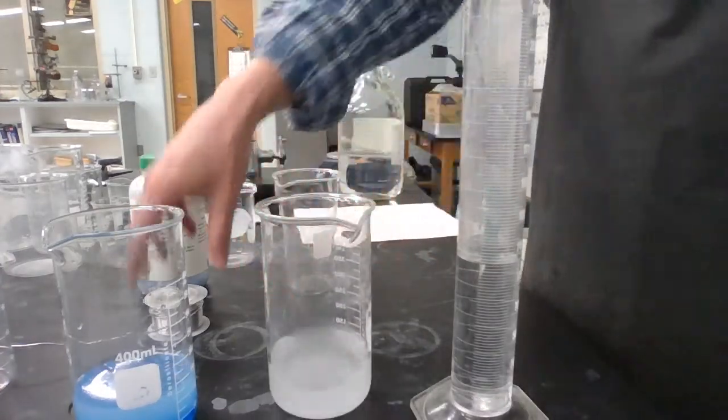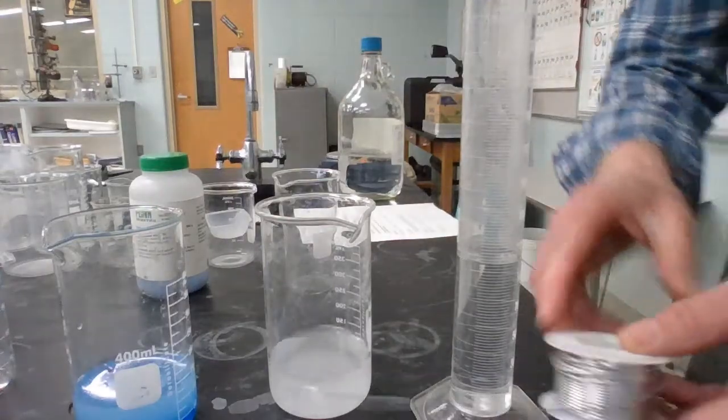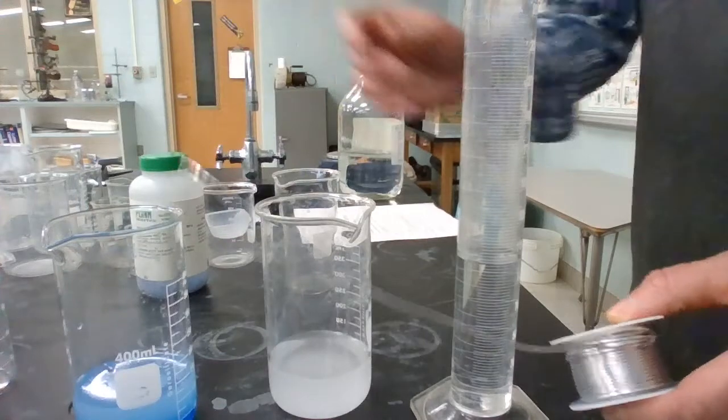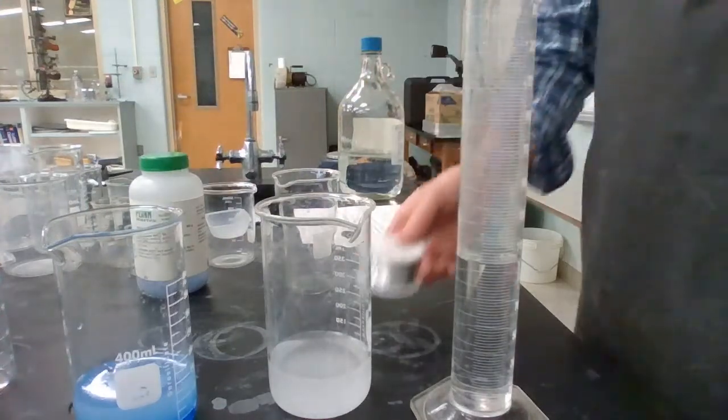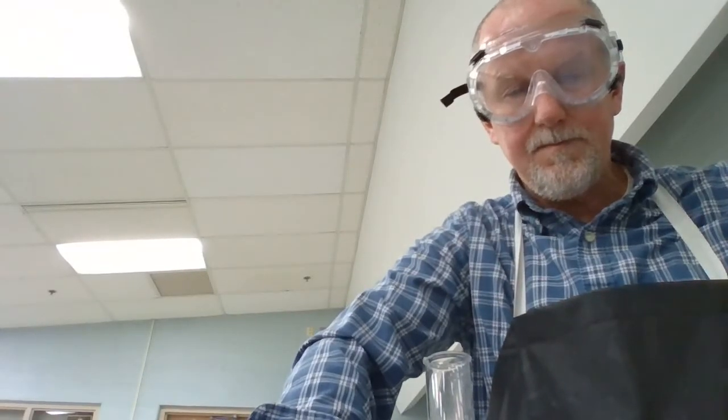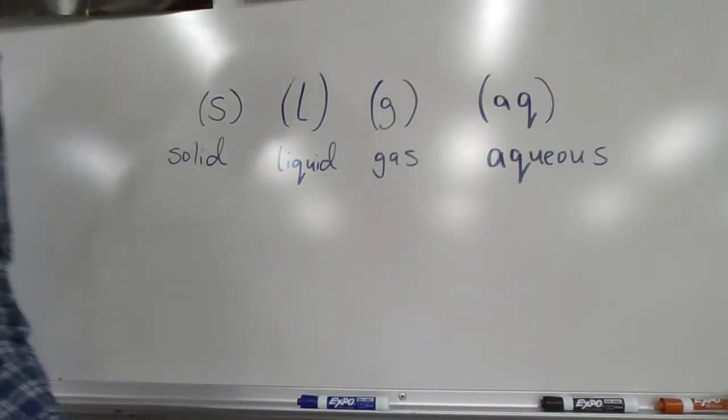Now the last player is aluminum wire. Here it is right here. Wire made of aluminum. And so we'll use a piece of that. So, onward. Oh yeah, one more thing.